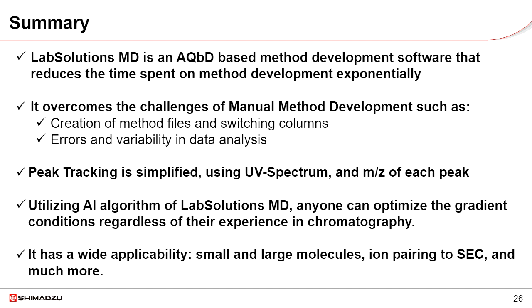So as we wrap up our presentation on LabSolutions MD, I hope you found this information to be useful and you're thinking, how could we incorporate these types of automation tools into our own method development tasks? We design the software around AQbD principles to help you reduce the amount of time spent in method development and to eliminate errors that may occur when we manipulate all of those manual methods by switching the columns and changing the mobile phases.